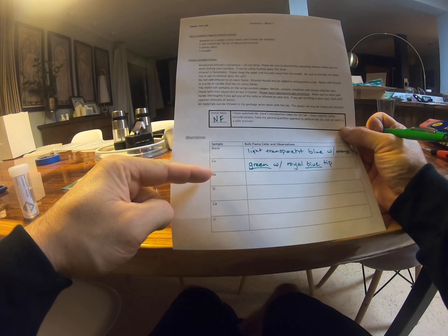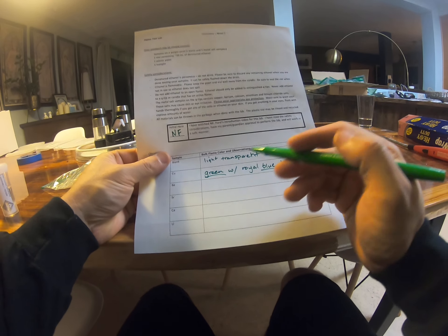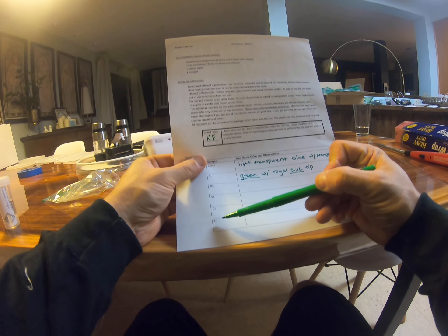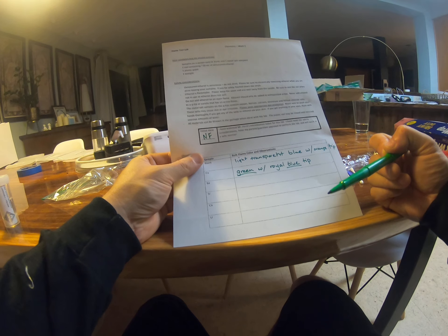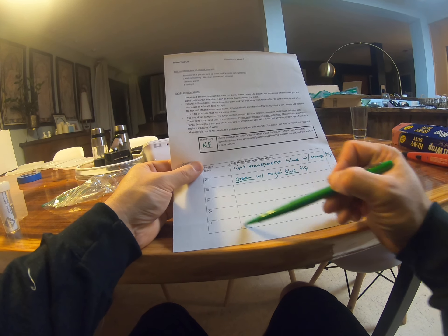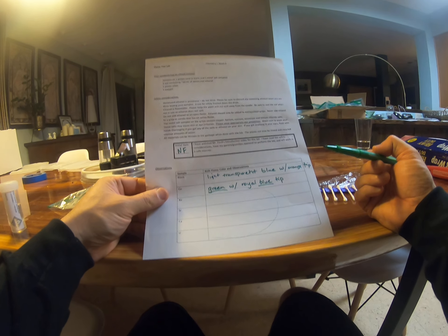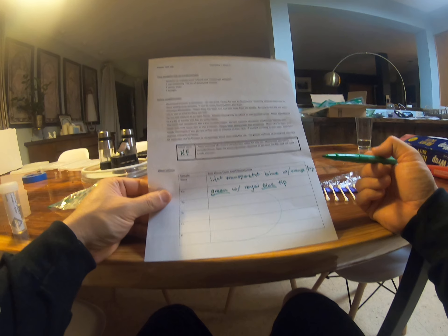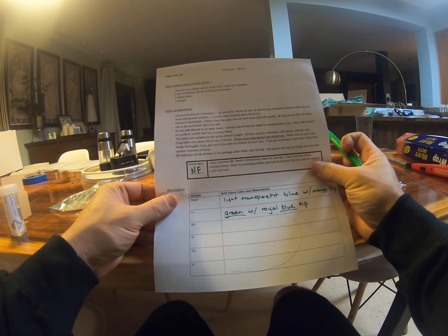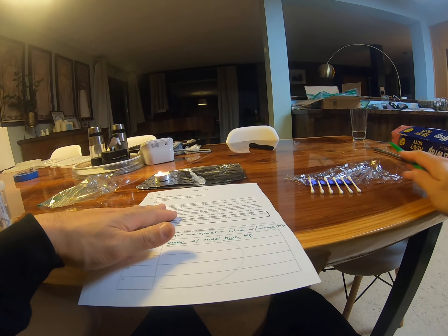So let's set this back. What I would do — the blank was a light, transparent blue with an orange tip. And the copper — its bulk flame color was green with a royal blue tip. So I saw green and blue for the copper. Your job is now to go observe the bulk flame color — the majority of the flame color. There's always going to be a blue with an orange tip background from the ethanol, but what's the new color imparted by the metal? We're testing barium, strontium, calcium, and lithium, and they're each going to give a slightly different flame.